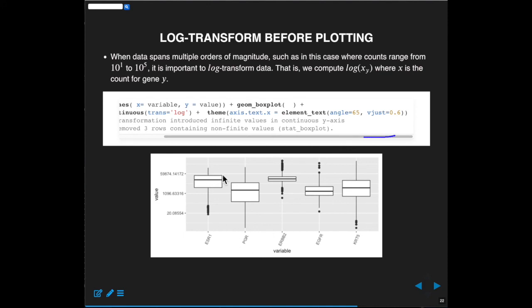But you can see here now you have in a box plot this center region, okay? And in that center box, this is the box of the box plot, this line in the middle, that's the median of the distribution, okay? So you can see that the median across the 5 genes does change quite a bit between the different genes. This upper line here represents the 75th percentile of the distribution, and this line represents the 25th percentile. The whiskers, this guy here and that guy there, is 1.5 times this region here. Basically, if you go from the end of this whisker to that whisker, it's a region that contains about 95% of all of the points.